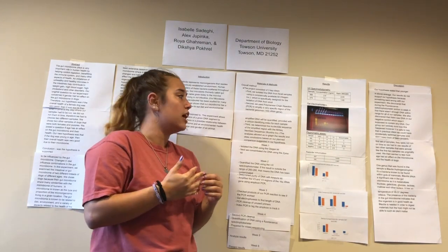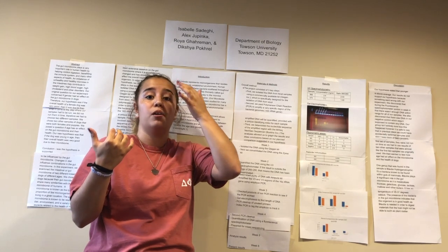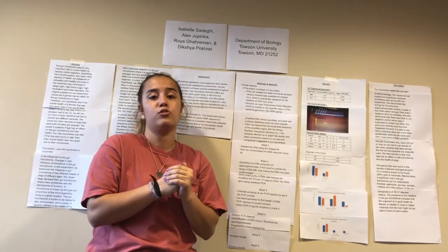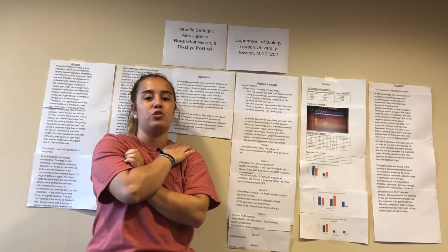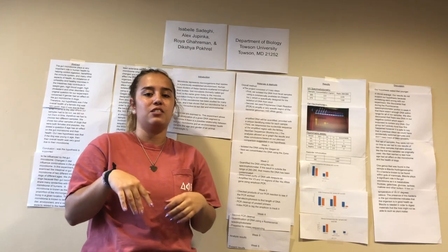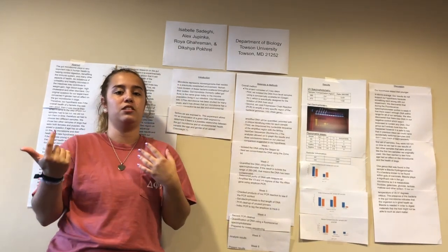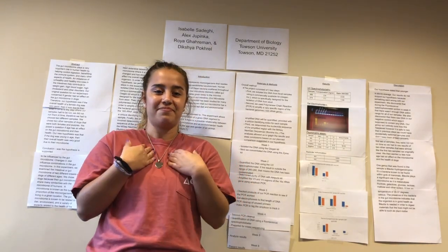And what our results tell us about cross-contamination is that it happens somewhere in the middle of our processing of the DNA concentration, which was a possibility that we didn't follow the instructions as properly as we should and possibly switched the samples by accident since the negative control wasn't supposed to have DNA in it.